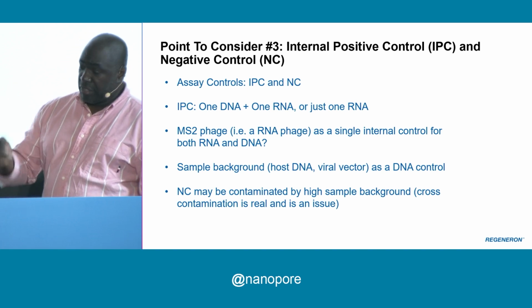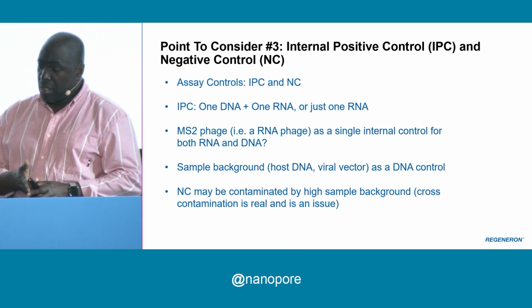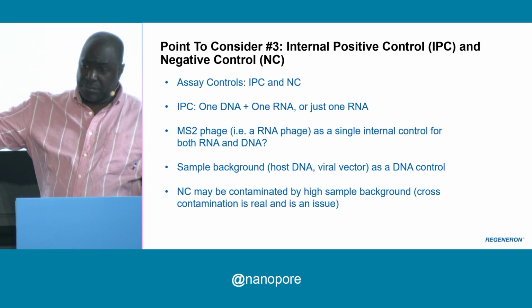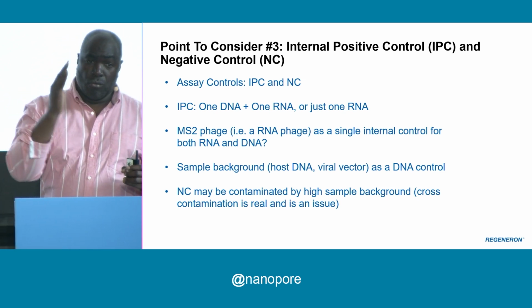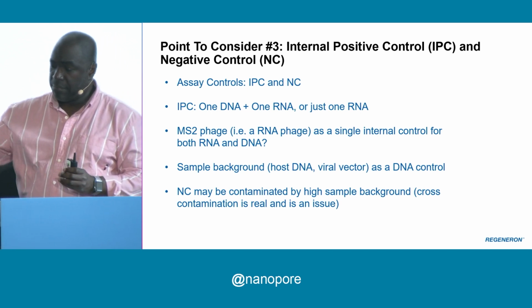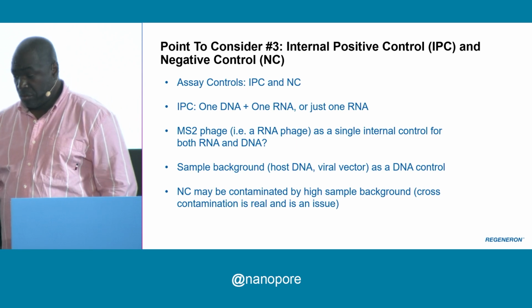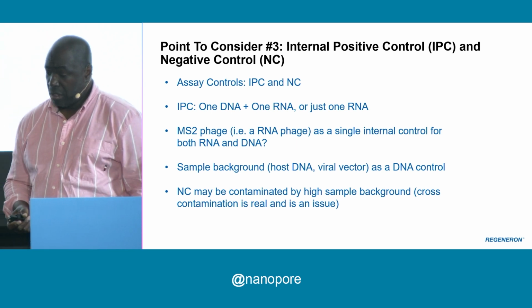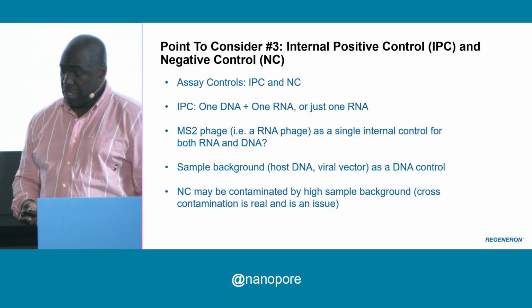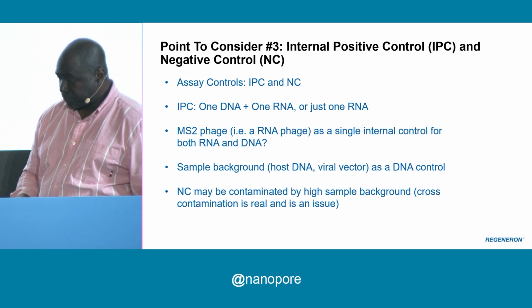For this type of study, we laid out the process, and then we did a risk assessment of each step to see what is the highest risk of cross-contamination at each step and provide a mitigation for those. So the bottom line is to work in a clean room where you have control of the environment so that you don't contaminate with amplicon or genomic sequence.